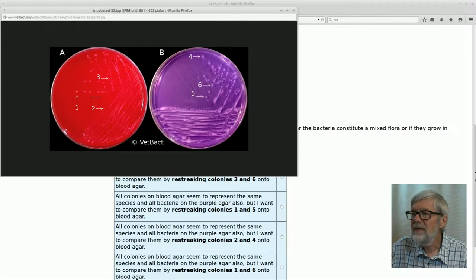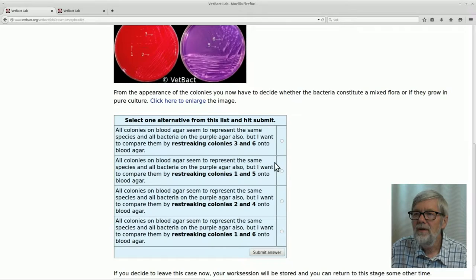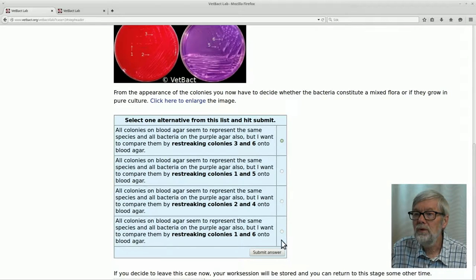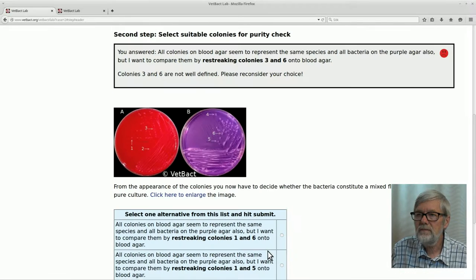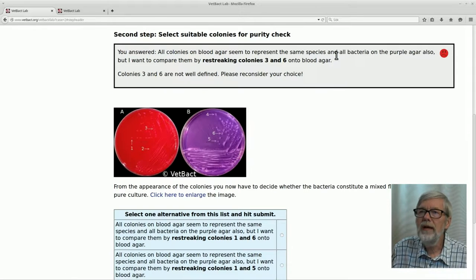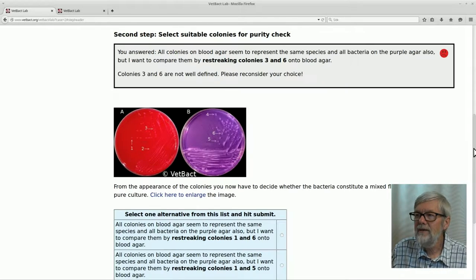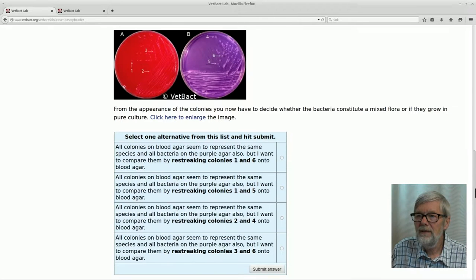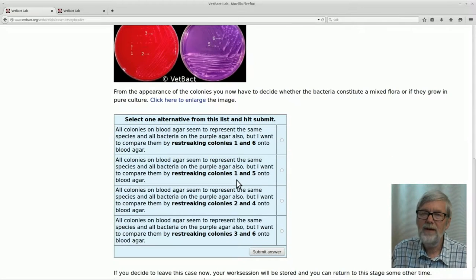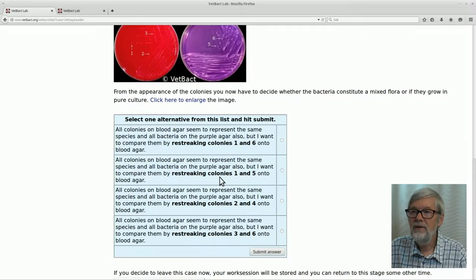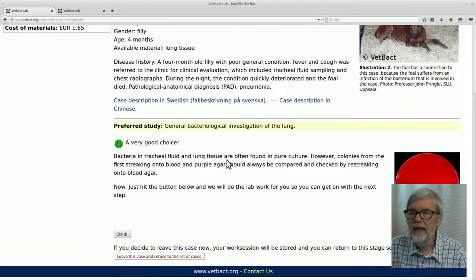But let's select something else to see what happens — let's select three and six instead. You can see that this was not the correct answer and you get another chance to select the right one. The questions come in different order here, but now you can select one and five instead and submit the answer. And that was correct.